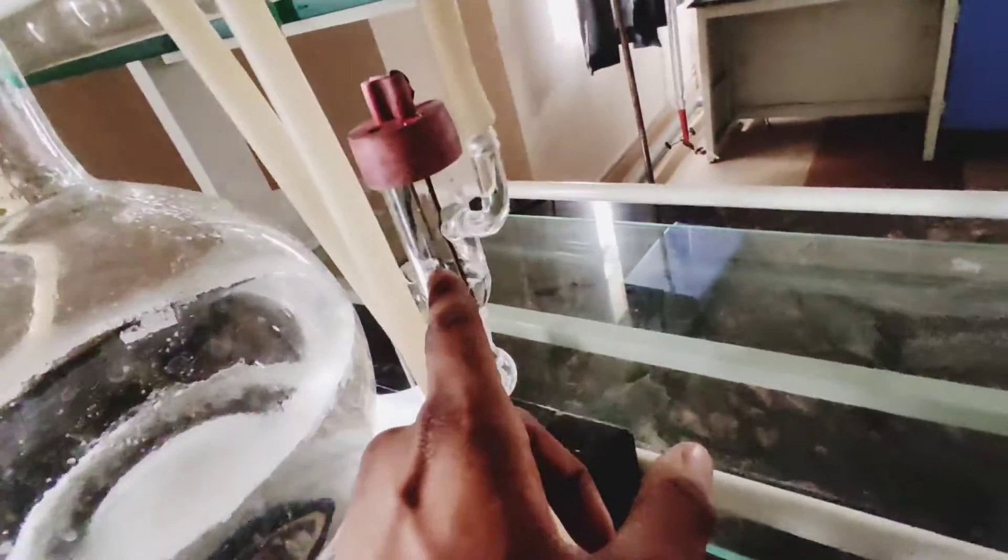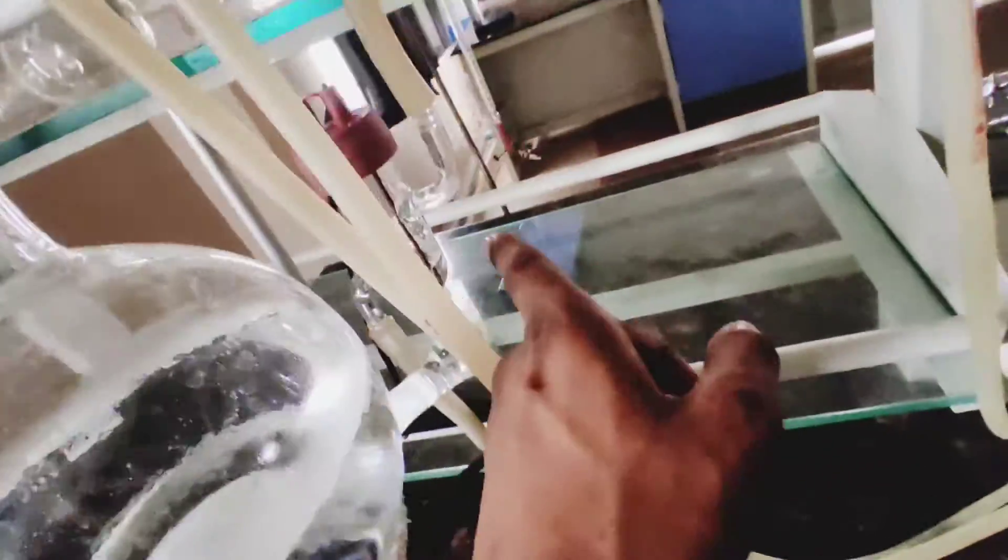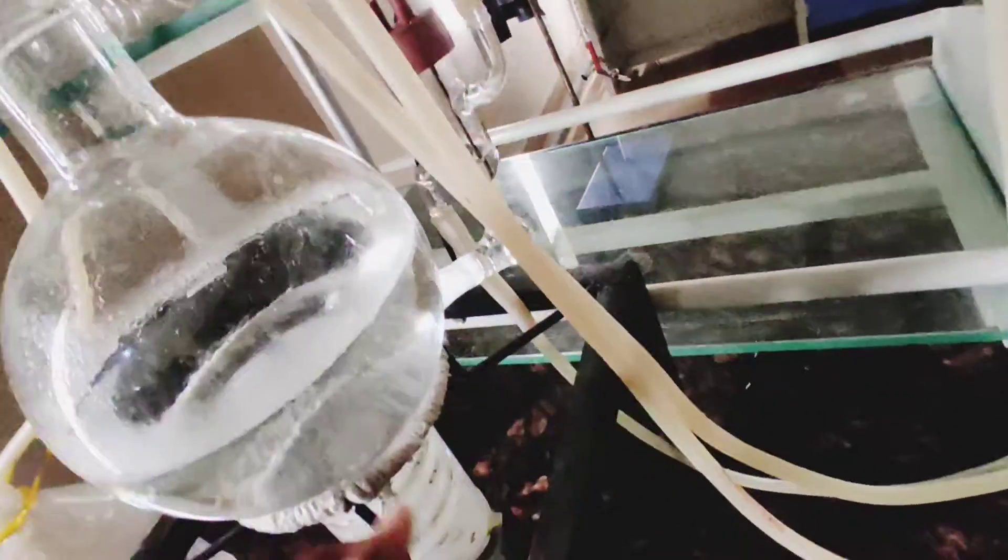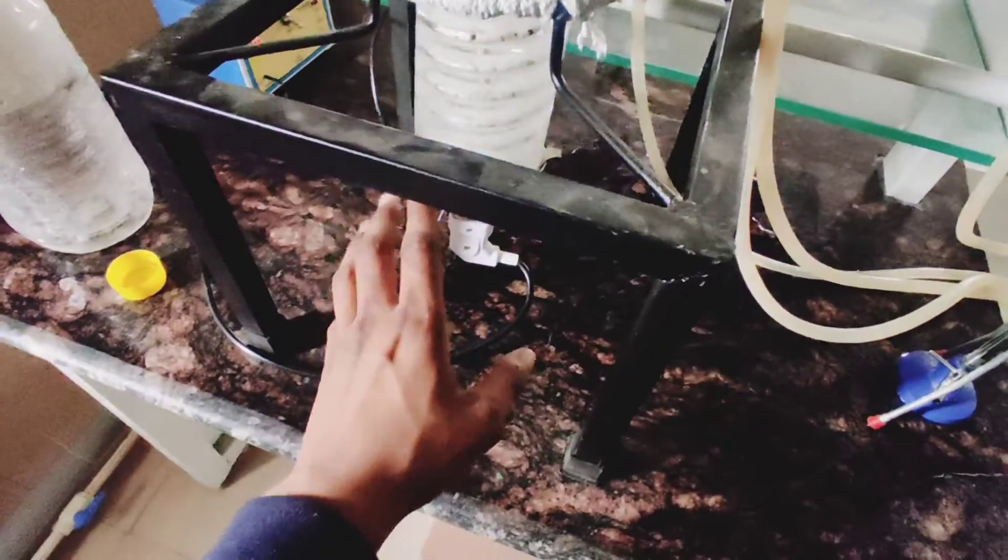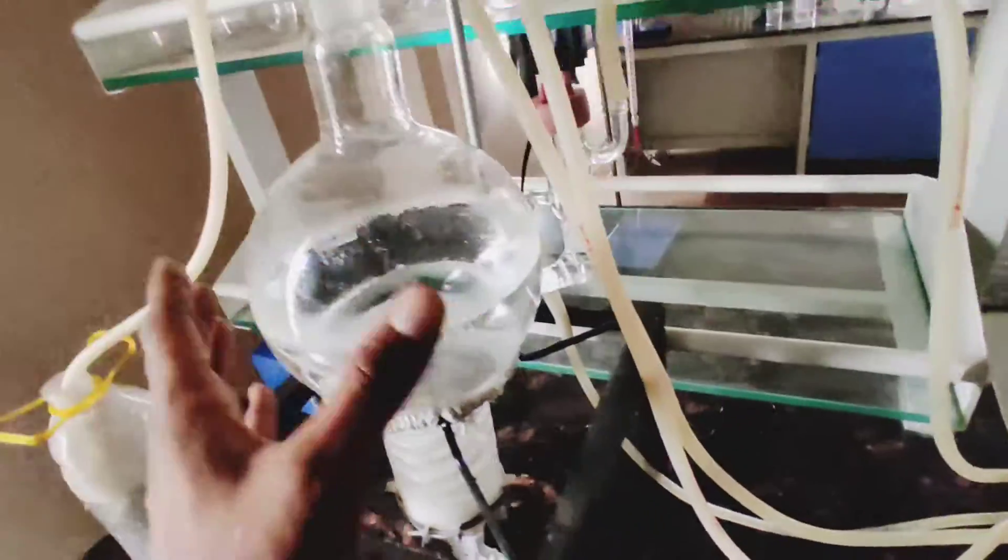And this sensor is attached to the system. If there is no water, then it will not go. Obviously this is where water will start.